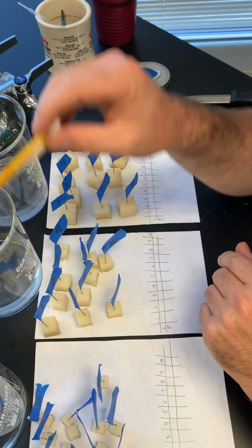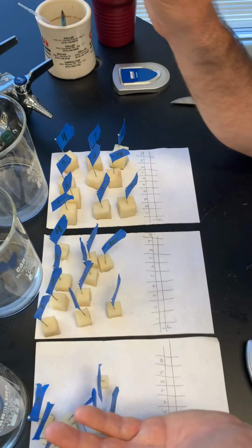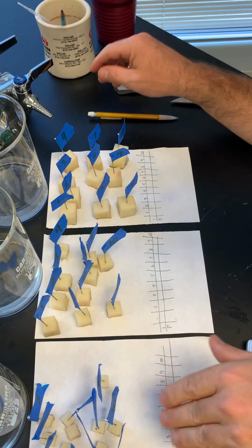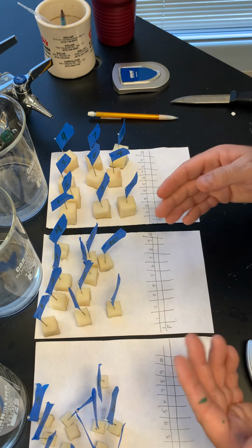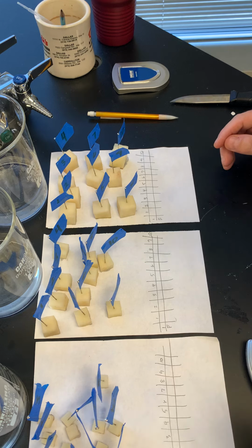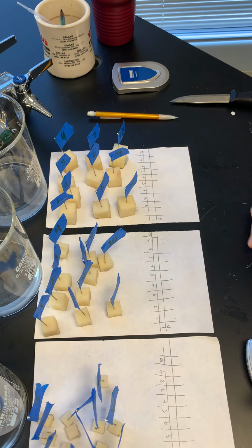Nevertheless, these are all going to be pure water. I'm not going to have any difference in my solute concentration, but if you were using solute concentration, all these would have to be the same size. You'd have to control for surface area to volume ratio. So these could all be maybe 1 cubic centimeter or 1.5 cubic centimeters, whatever is easier for you to cut. You're going to cut potatoes of your own. You're not going to use my data. You're going to do it yourself. I think that'll help. Last time you watched me do it, and I don't think that went quite as well.